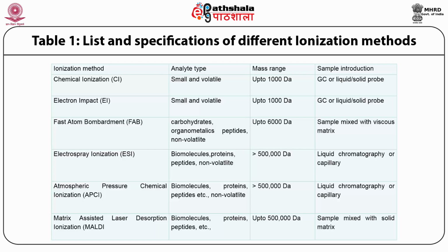For example, electron impact ionization is mostly used for GC-MS and is considered a hard ionization technique because it causes fragmentation of ions. Ionization of gaseous and volatile substances can be made by energetic electrons. In this method, a beam of electrons is formed by heating a filament biased at a negative voltage compared to the source.